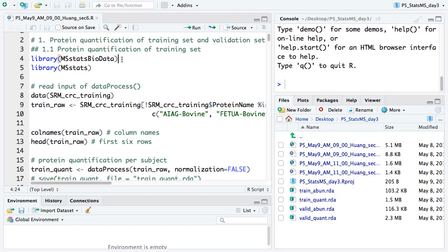In the CRC dataset — the colorectal cancer dataset — Meena built a data package. In Bioconductor, you can build a data package where you put your dataset in that package. Meena made a package called MSStatsBioData. In that dataset, there are different peak intensity datasets we have used for MSStats. The colorectal cancer dataset is also available in that package, so we need to first load it.